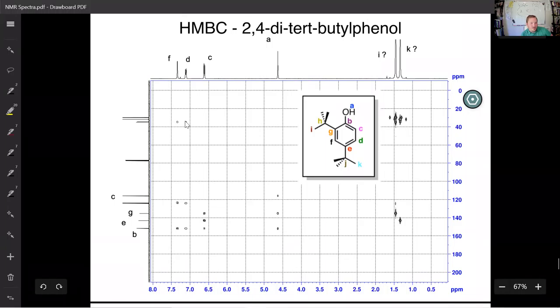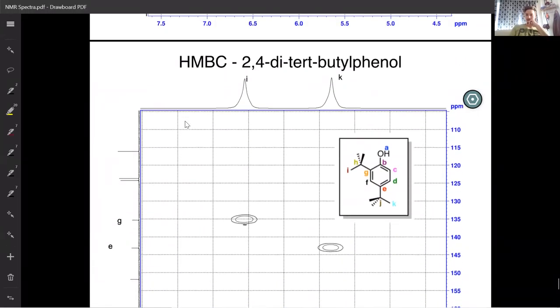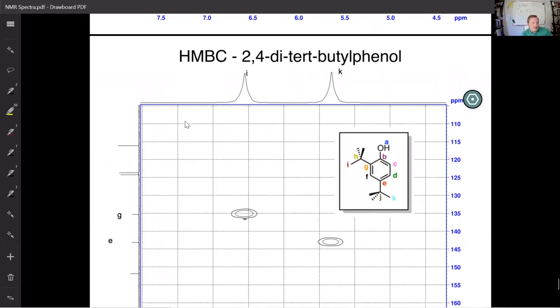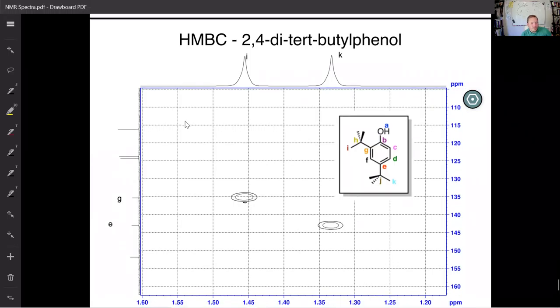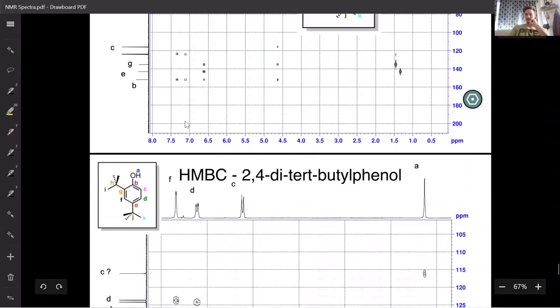Maybe in this area. So D has a signal coupled down there. F might have 2 signals. If you keep looking, there might be a zoomed in one down at that region. Yes. So that would be, is it this one? So that's proton signals. Go down one more, see if there's one more there. I'm struggling making sense out of this particular one. Yeah, so they don't have a zoomed in version of the aromatic hydrogens coupled to H or J.